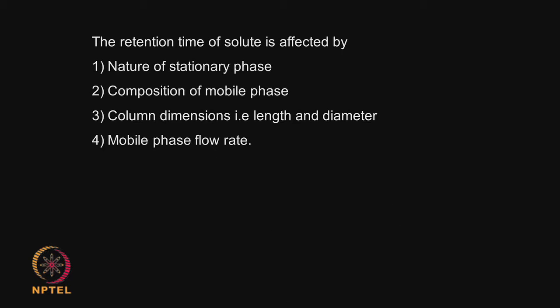The retention time of a solute is affected by the nature of the stationary phase, that means what type of stationary phase I am using, what is the particle size of the stationary solid, what is the porosity and so on. The composition of the mobile phase: am I using a hydrophilic mobile phase, a hydrophobic one, or a mixture of them, what is the dielectric constant and so on.